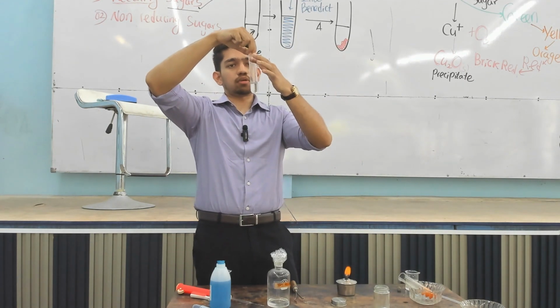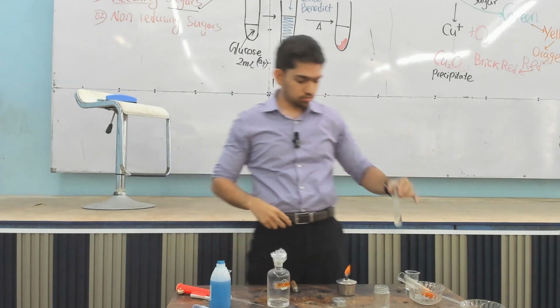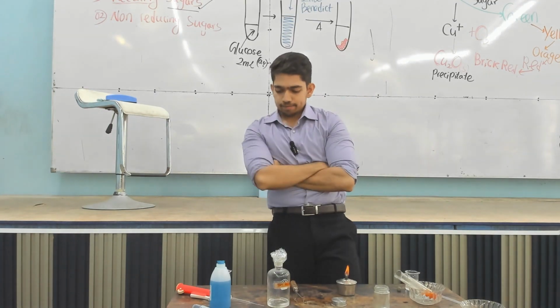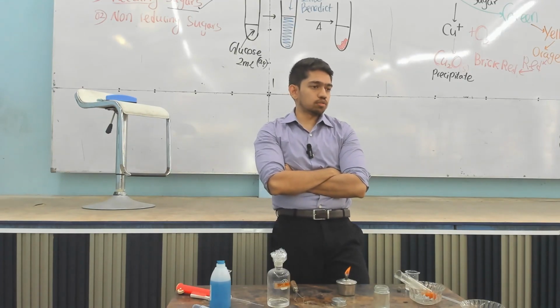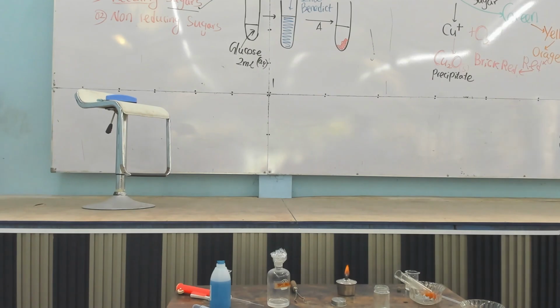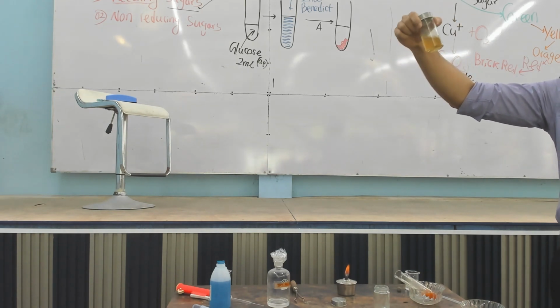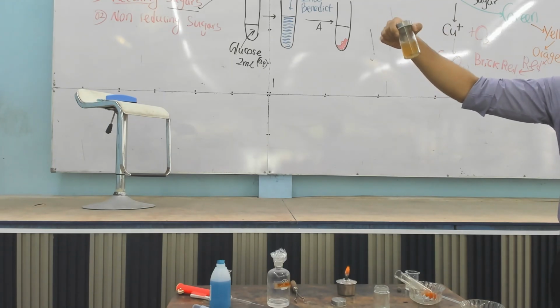So this is acidified, no? Right? Still it's a bit hot, right? Then today, if we have time, we have the lipids identification, and for that I also brought some honey. This is an aqueous solution of honey, okay. If you do a reducing sugar test on honey, what's going to be the result? Fructose, is it a reducing sugar or not? It is. So it should theoretically give a positive result.